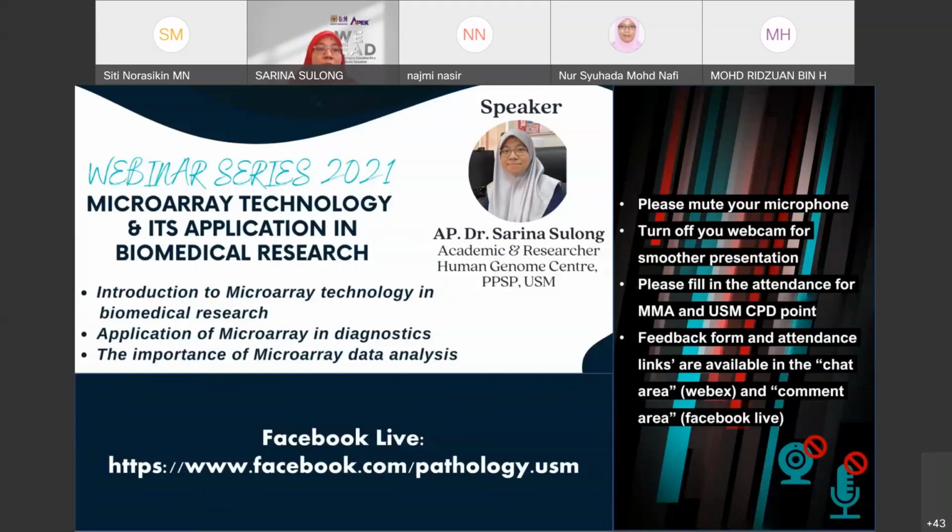If you want to do NGS or microarray, of course, we can outsource if you don't want to do it by yourself. The company will provide you the raw data or some basic superficial data, and sometimes the company will charge you if you want further data analysis. So the major part of the process, the data analysis itself, whether it's microarray or NGS, needs integrated support and collaboration, and we need engagement with bioinformatics to help us understand the data generated from NGS or microarray technology.